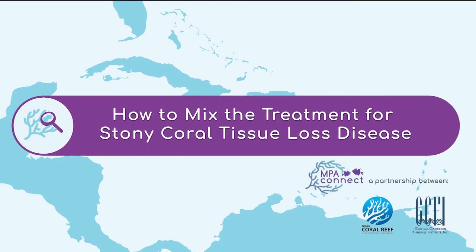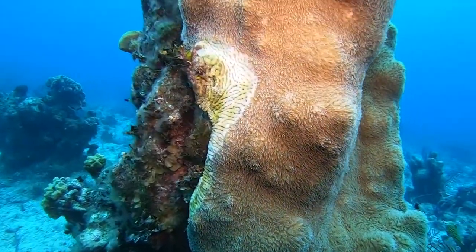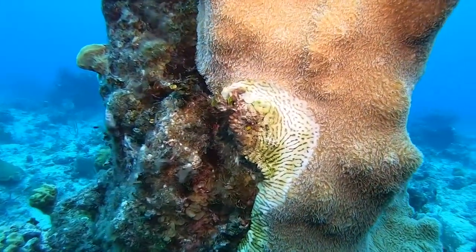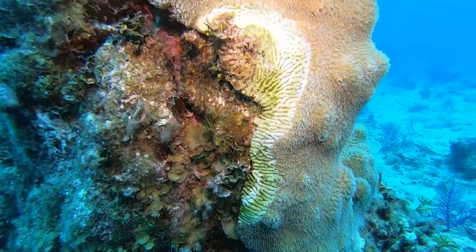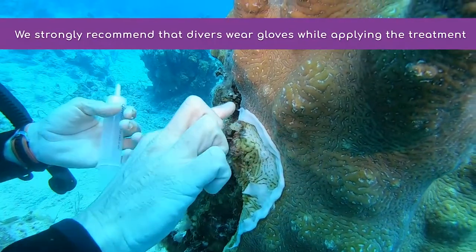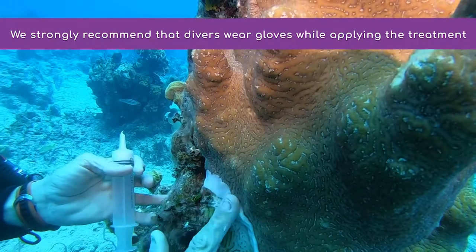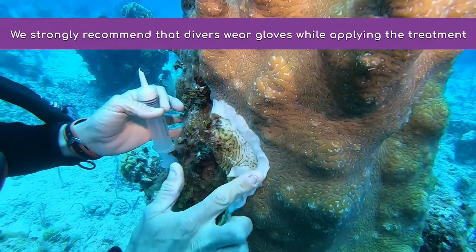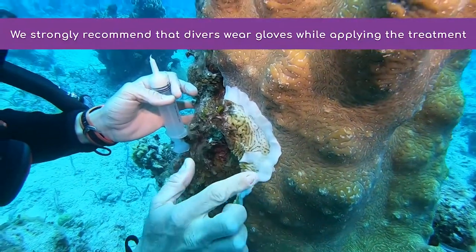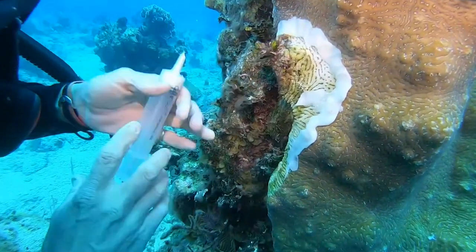Since 2014, Florida and Caribbean coral reefs have been threatened by a new disease called Stony Coral Tissue Loss Disease. Currently, the most effective treatment is the topical application of antibiotics, specifically amoxicillin, using a specially developed pharmaceutical paste called Base-2B. The mixture is applied along the margin of the disease lesion, preventing its progression. This video will show you how to prepare the mixture so it can be successfully applied to diseased reef.